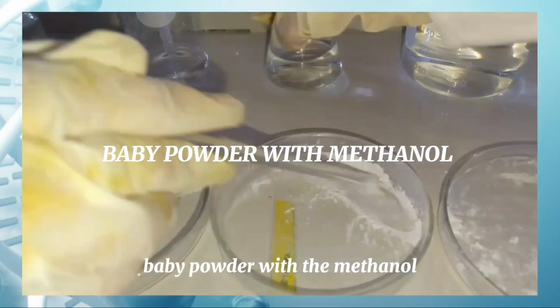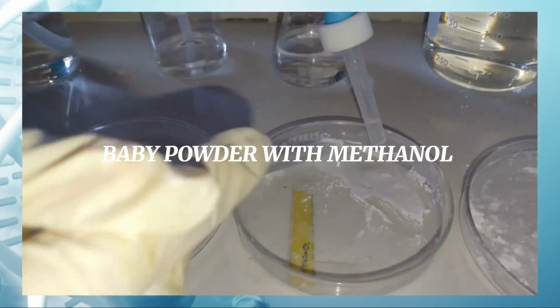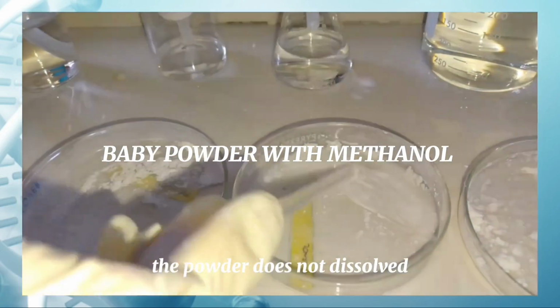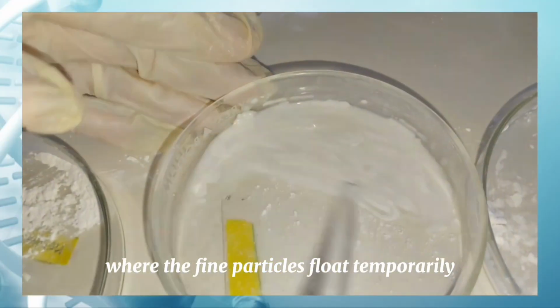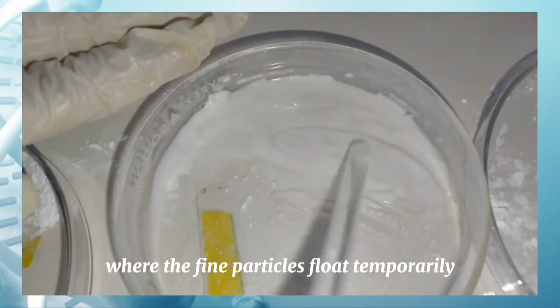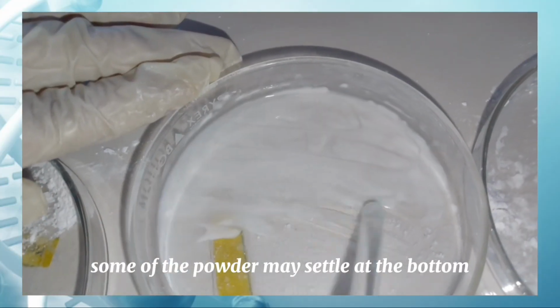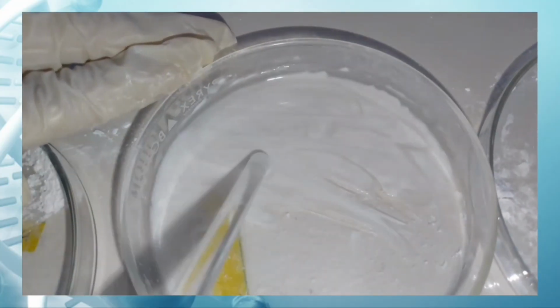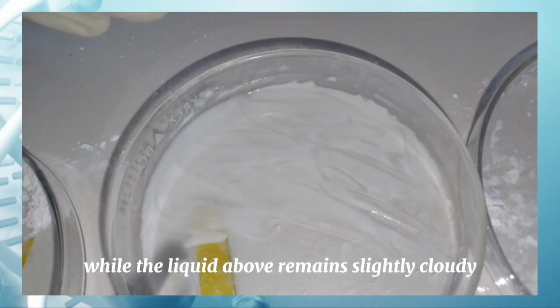Baby powder with methanol. When baby powder is mixed with methanol, the powder does not dissolve. Instead, it forms a cloudy mixture where the fine particles float temporarily in the liquid. After a few moments, some of the powder may settle at the bottom, while the liquid above remains slightly cloudy.